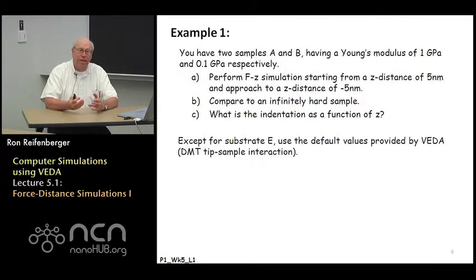With this ability to do simulations, you can start to do examples and build up some confidence in the types of force versus distance curves you might see in experiment. So I just cooked up a simple example here. I have 2 samples, A and B. One sample has a Young's modulus of 1 gigapascal. The other has a Young's modulus of 1/10 of a gigapascal.